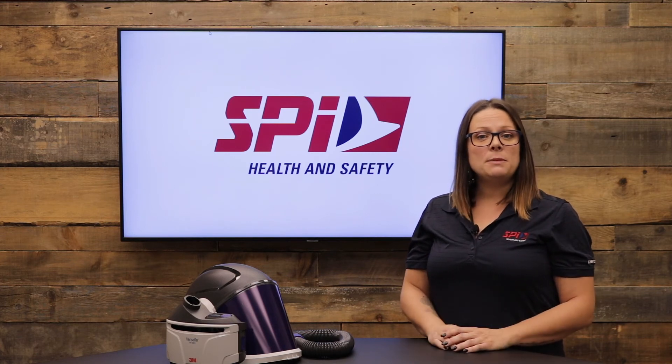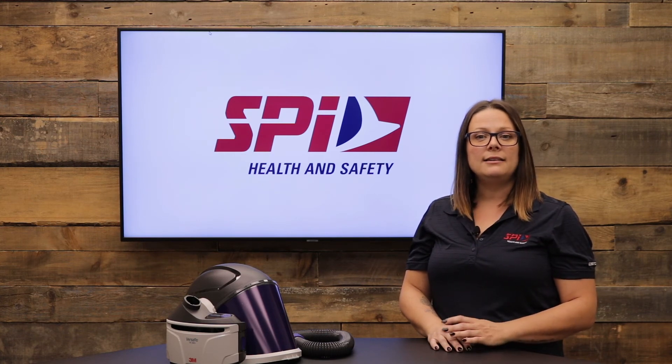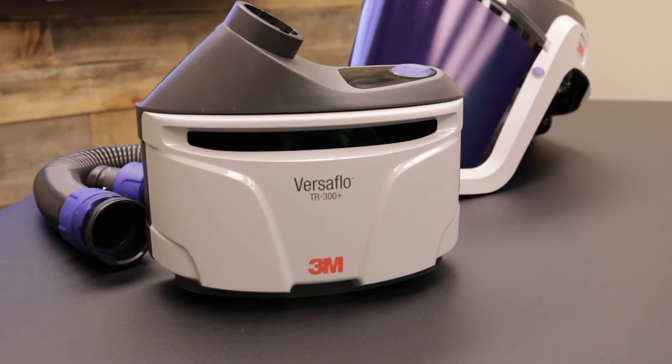This PPE requires effortless maintenance. The battery and filter can be changed quickly and easily by hand without the use of any tools. The belt and blower unit has smooth surfaces facilitating quick wipe downs for easy cleaning.